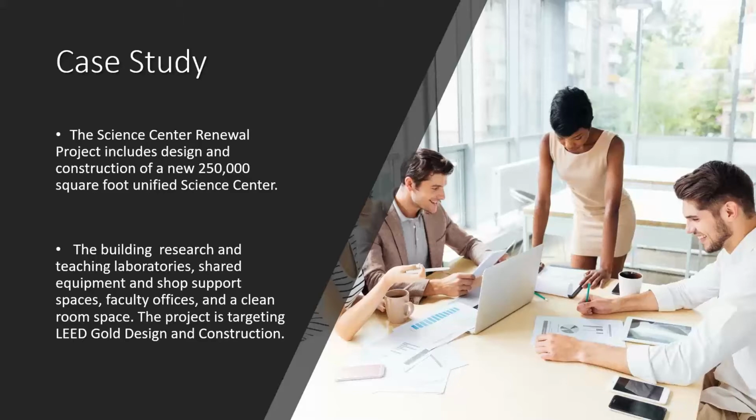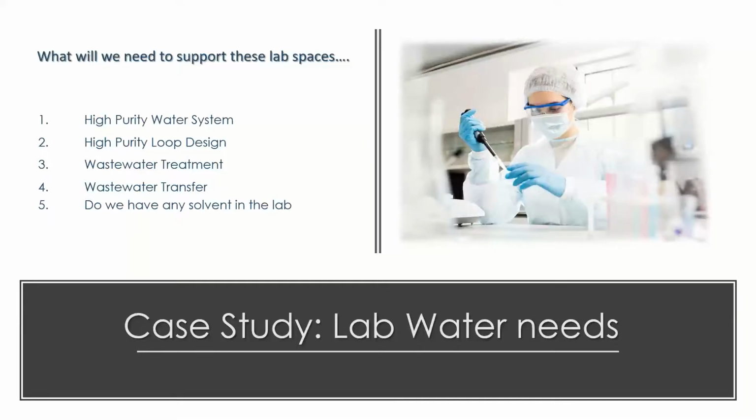Today we're pretty much focusing on what you would really need or look at if you're going to be setting up a lab space within this type of a building. All lab spaces, kind of regardless of what they are, their clean room, their biology, their chemistry, their manufacturing, their research, the startup company, startup pharmas, which are very common and kind of popping up, they need a couple of different things.